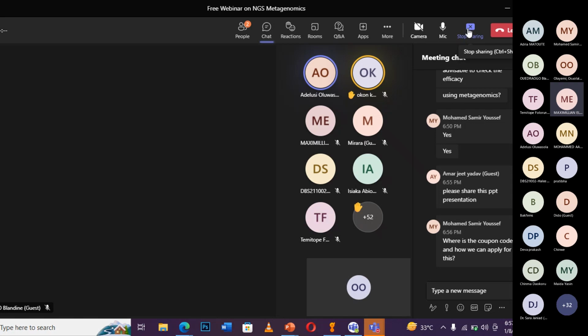So this is it. For instance, you are working with a water sample. Take the water sample that you have, and you can take it to the lab. What they will do is extract the DNA. There's a need for extraction of the DNA before PCR. I have an understanding when it comes to the molecular aspect. So first, get the sample raw. If there's no culturing, it means they have to extract the DNA from the sample itself. So the extraction of the DNA is the start of metagenomic sequencing. But you have to know, is it shotgun metagenomic sequencing you want to do or 16S rRNA?